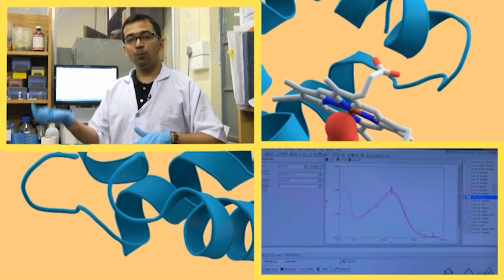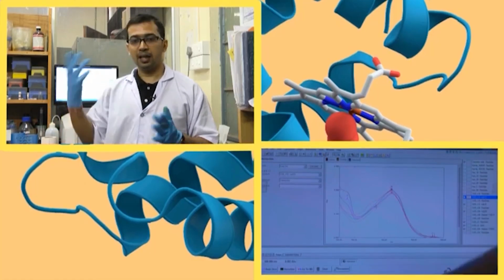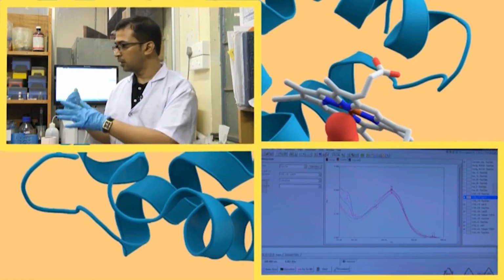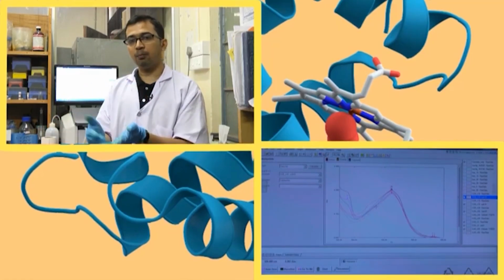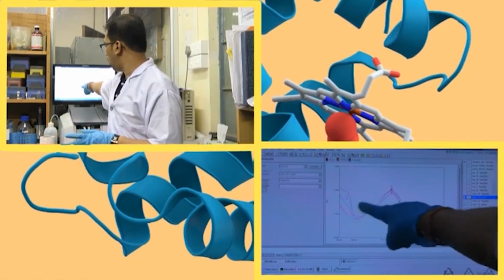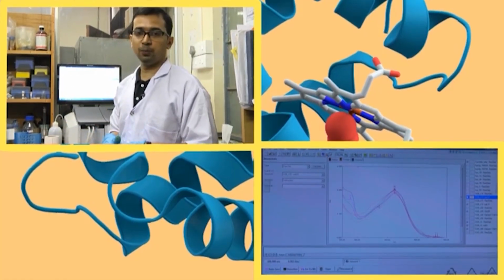And now, when you are adding more and more concentration of HSA to it, those curcumin which were not solubilized in water are becoming more and more solubilized, and as a result its absorbance again increases. So, the anomaly in absorbance which you might be getting for those components which are not properly soluble in water may be due to this reason, where the protein ligand interaction might result in solubility issues. Okay. So, in this way we can say that it is safe to take the absorbance in this region where there is a constant decrease. Okay. In this region there is a constant decrease in the absorbance value, and from there we can measure the change in the absorbance value.